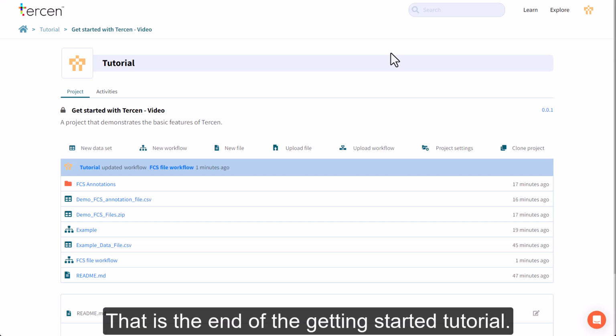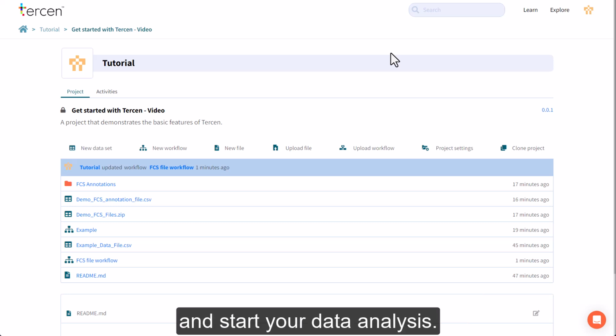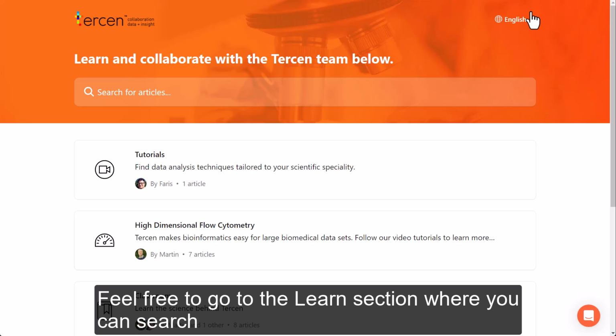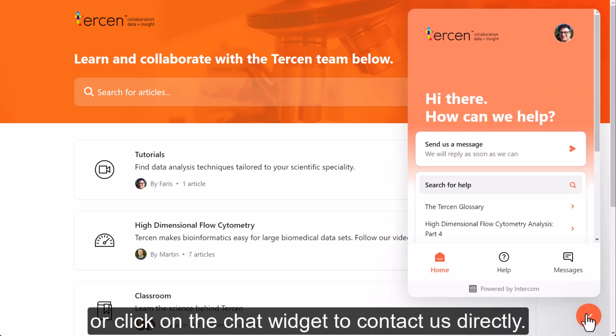That is the end of the Getting Started tutorial. Now you should have the basic skills to navigate Tercen and start your data analysis. Feel free to go to the Learn section where you can search for help articles and tutorials, or click on the chat widget to contact us directly.